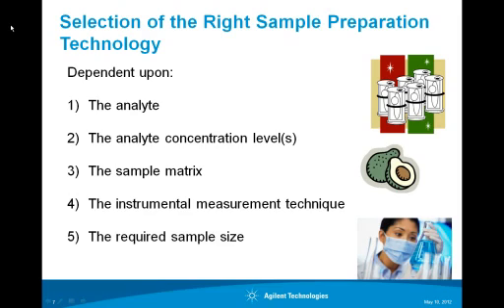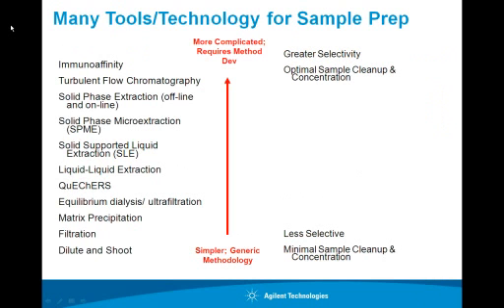And what is my analyte then? What's the sample matrix? What type of instrumentation do I have that I can use to analyze my compound? And the required sample size. Am I going to have enough to work with?